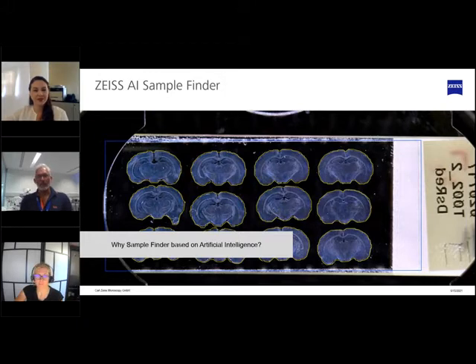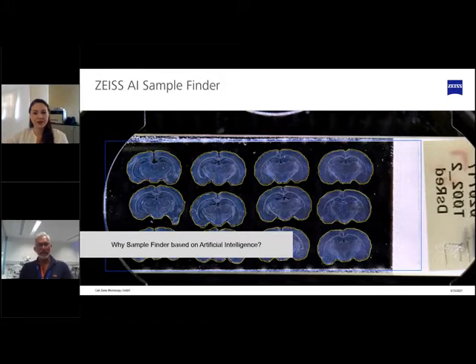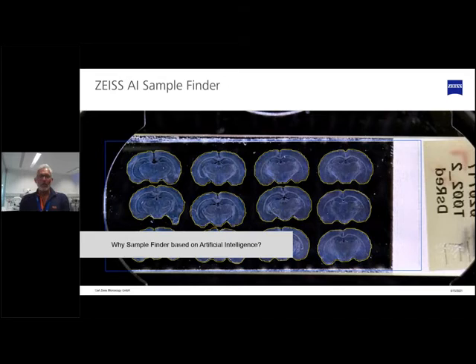Thank you, Colleen. Thank you, Samantha. Hello, everybody. Let's start with some basic understanding, and let's ask, why do we think we need a thing called sample finder based on artificial intelligence, and how may it help to add efficiency to your daily routine?